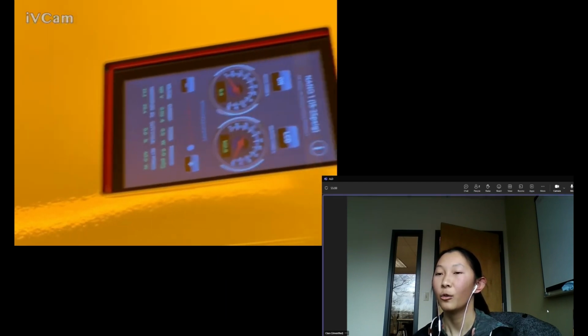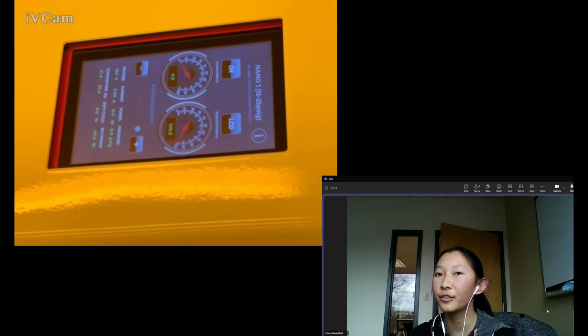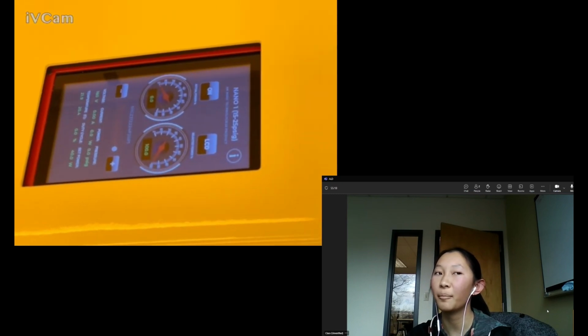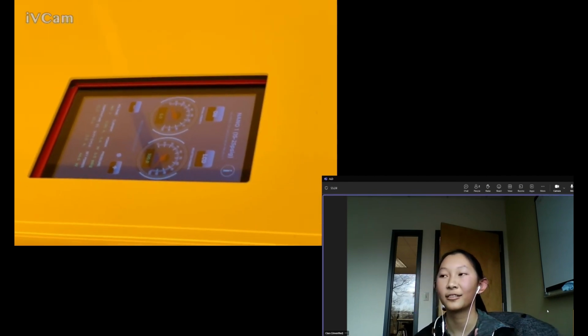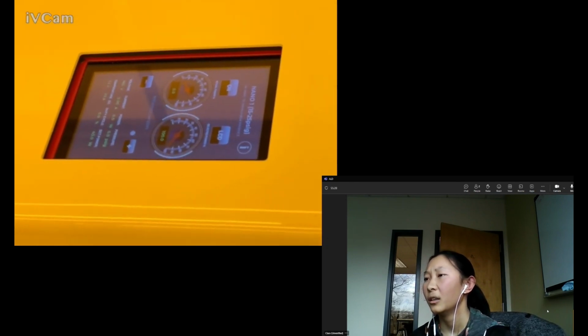So what happened? The popping made me think that maybe an airline got loose, and the ball dropped to the bottom. That would make sense. But if there's no hissing, that's fine. That means there's no air leaking. Okay, good. So I think it's good, but there's still no pressure on the top.